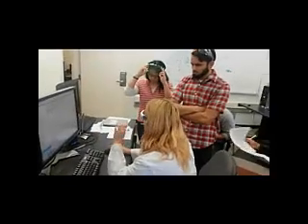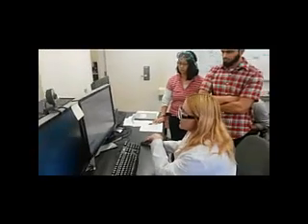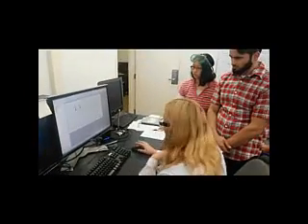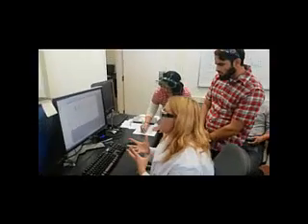This is a very typical MS graph. It looks horrible. You would think that one or that one would be caffeine, but you have to go based off of what your HPLC graph told you. Your HPLC graph told you that it eluted at 4.6. Now you need to give 0.1 to 0.5 seconds for the MS to pick up what the HPLC was saying. So instead of going over here to 3, you need to go past 4.6 to read your caffeine. Whatever your elution time is, you need to go past that to find the peak of the actual sample. I have a question.